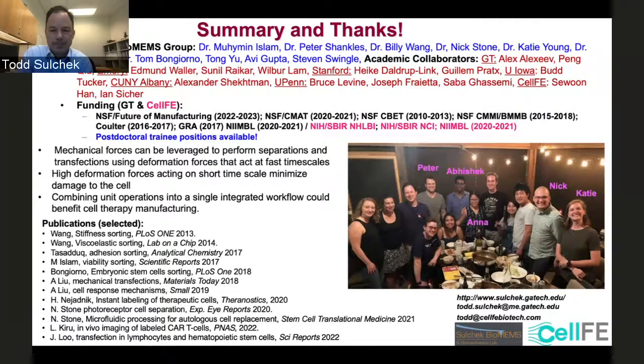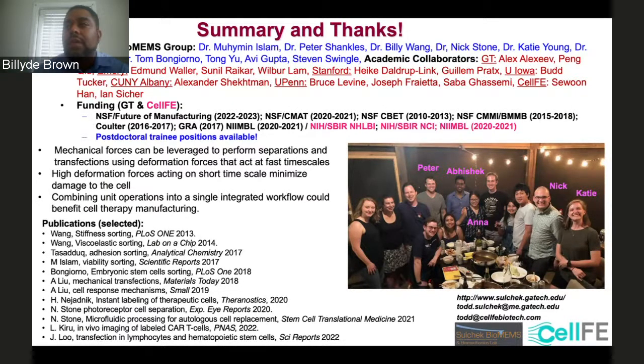Great, great. I have a question here, actually from Reginald Tran. The clinical scale up is very impressive. How about the opposite end with small scale pilot transfections for rare cells or small patient samples? Is there a minimum number of cells for screening and optimization purposes?